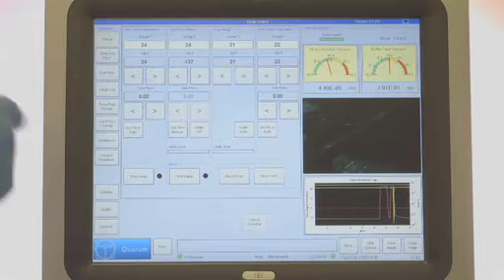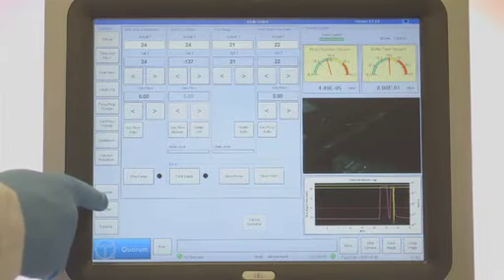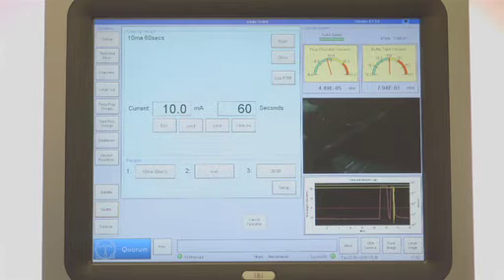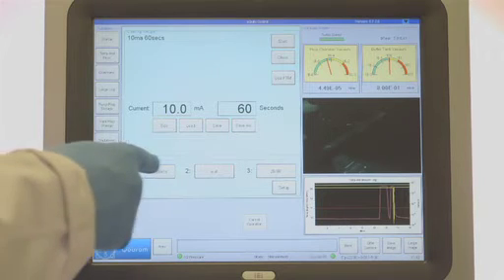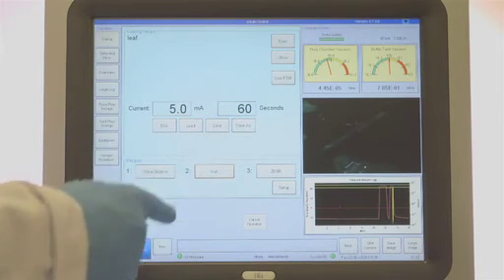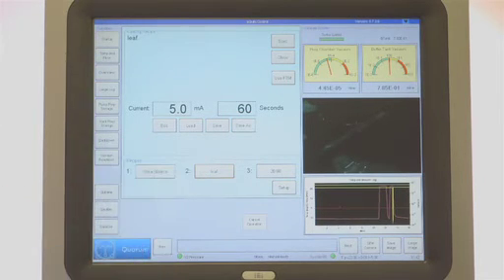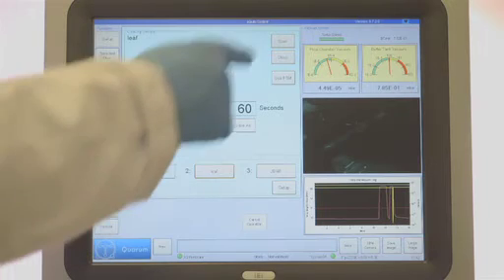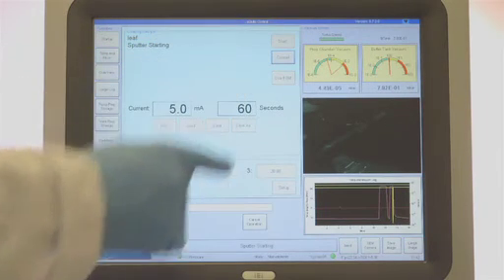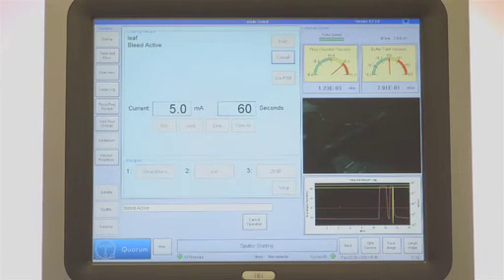The low-energy sputter coater is specifically designed for cryo-applications, and will give fine-grained coatings of metals such as platinum, gold palladium, iridium, and chromium. Sputtering is fully automatic and preferred recipes can also be stored.